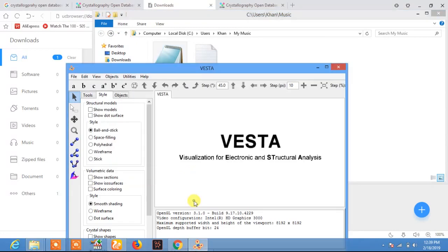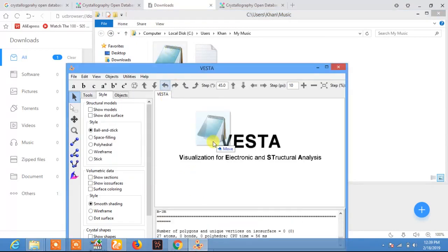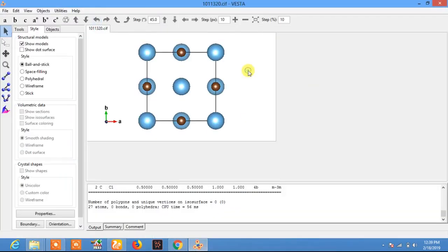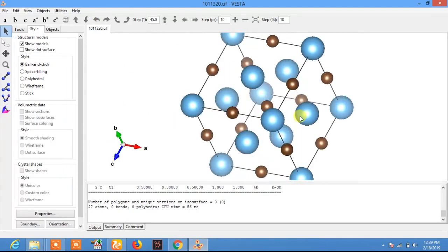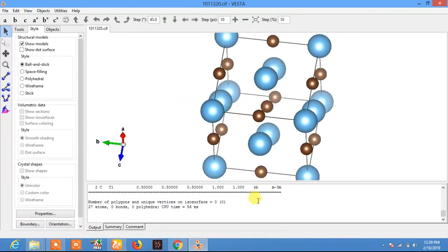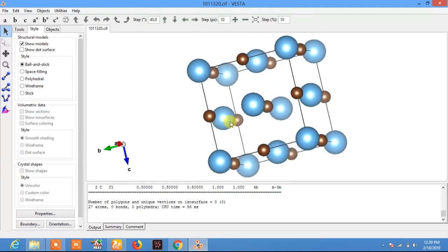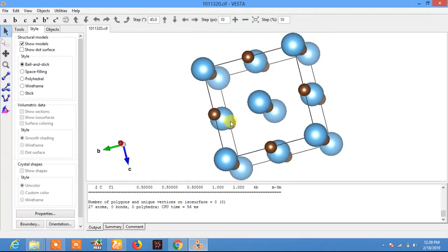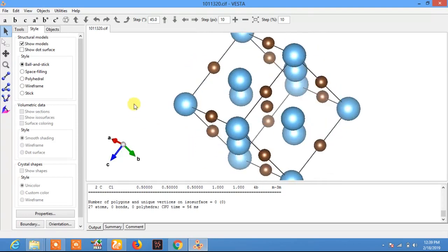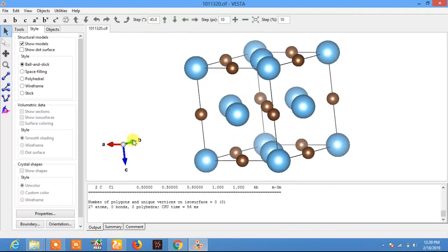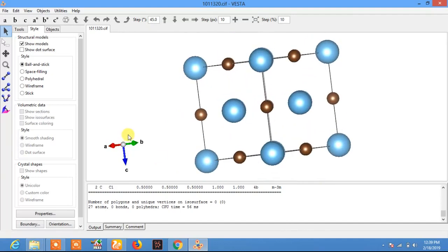Just drag the downloaded CIF file into VESTA, and here you see the crystal structure of titanium carbide which we downloaded from the Crystallographic Open Database. You can use this database freely, and you can also upload your own structures that are published in journals.